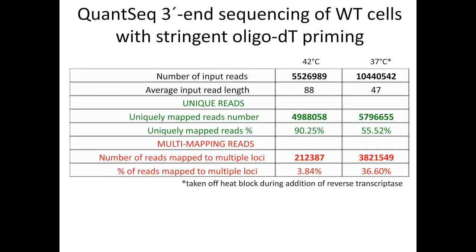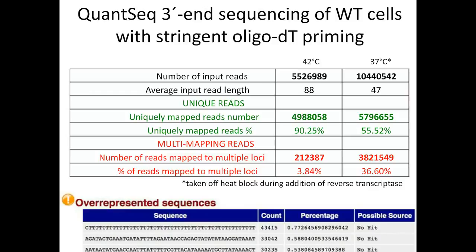And so now, by these slight modifications, we were able to obtain a huge increase in the quality of the library and decrease the internal priming. So here you can see the results of the sequencing library at 42 degrees with the reverse transcription step versus the 37 degree step. And so now instead of 55% of the reads mapping uniquely, we now have over 90%. And this corresponded to a roughly tenfold reduction in the internal priming. And so now we notice the overrepresented sequences were much lower in abundance.